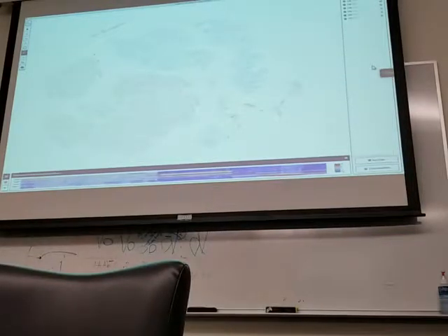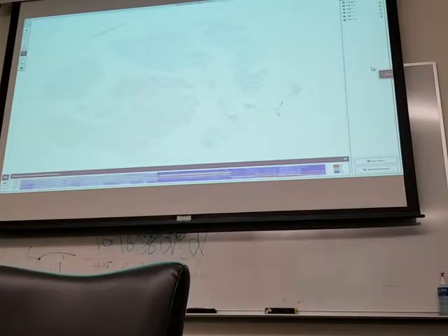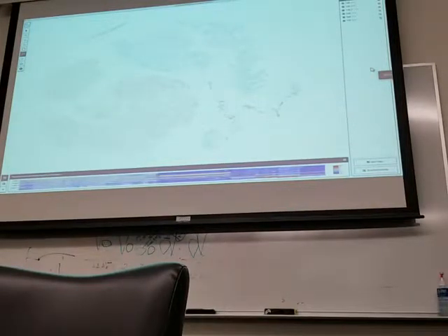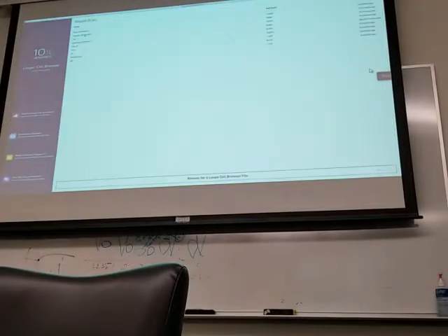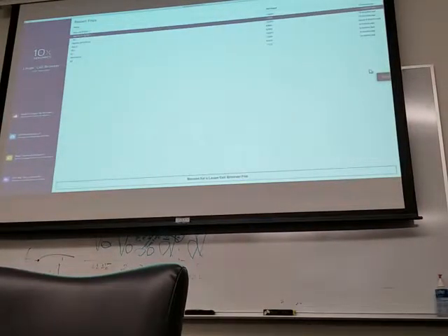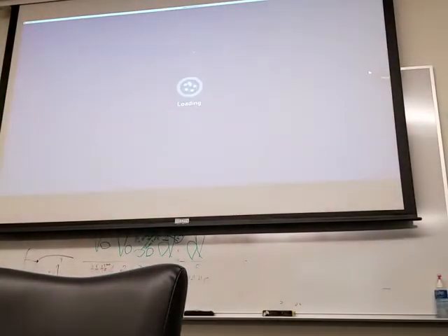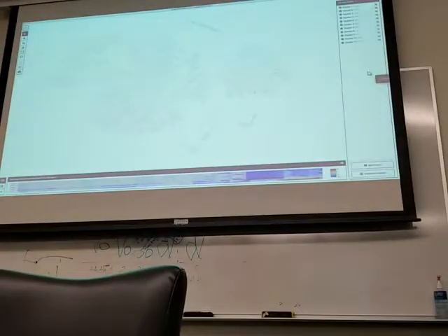So I also did this just as two different aggregates, one for just the 3' samples and one for just the 5' samples. Oh, you did do that? Just the 3' and 5'? Oh, yeah, I ran those today. It runs pretty quick, so it's not hard to run those. So this is for the 3' samples. And again, it does the clustering and everything.